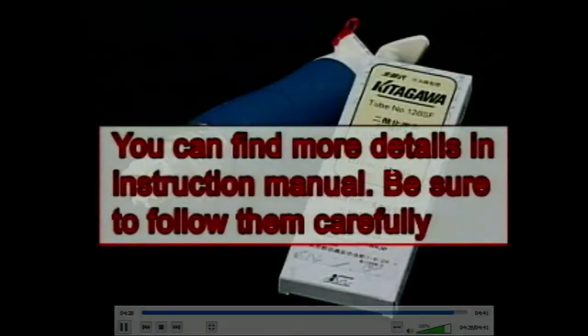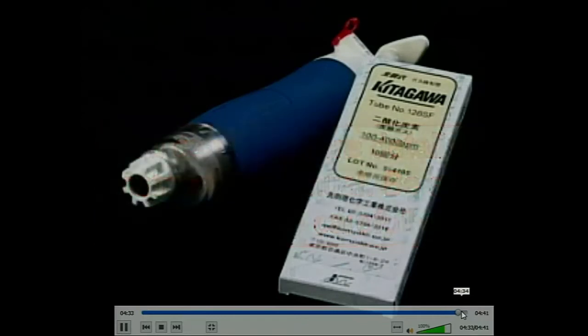Remember, be sure to read the instruction manual for the sampling pump and each detector tube prior to use, in order to assure proper operation. Okay.